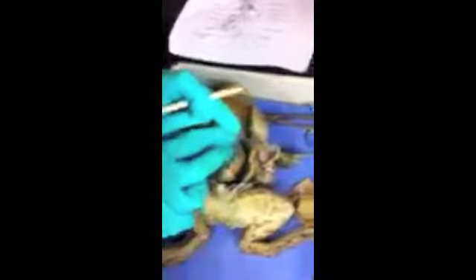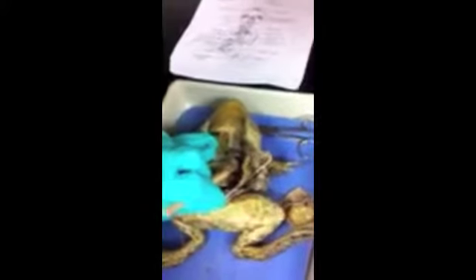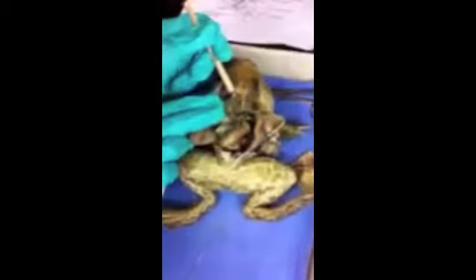If you move back the liver, and at the end of the stomach, the esophagus is up here. It comes after the tongue and leads to the stomach. The cardiac sphincter is a valve at the end of the esophagus that prevents backflow from the stomach.